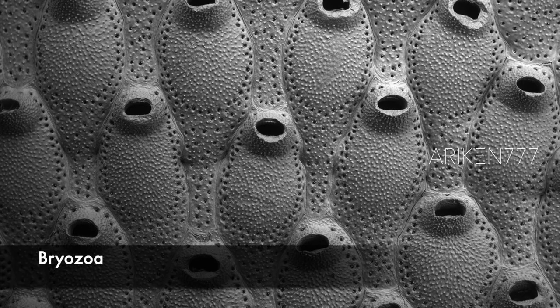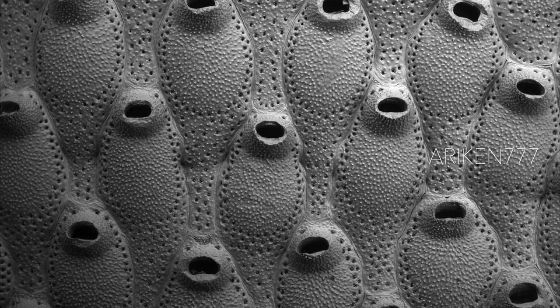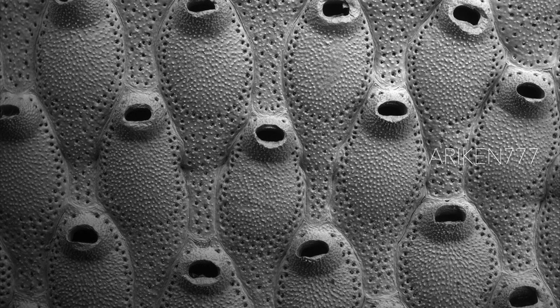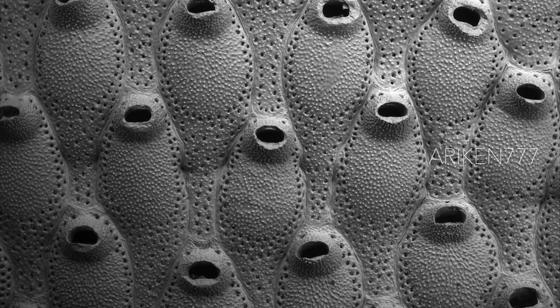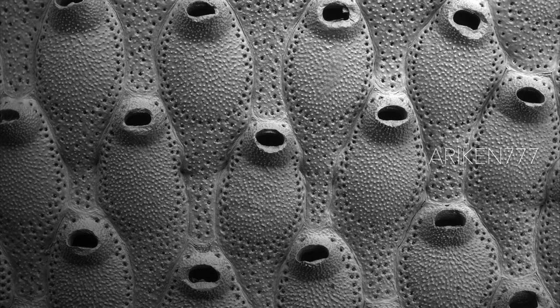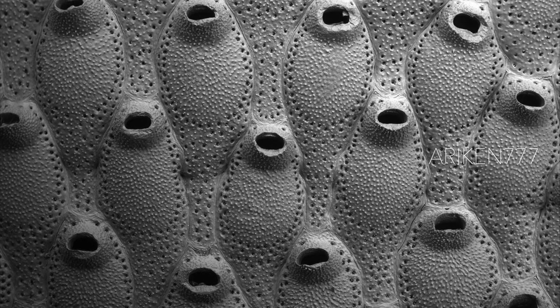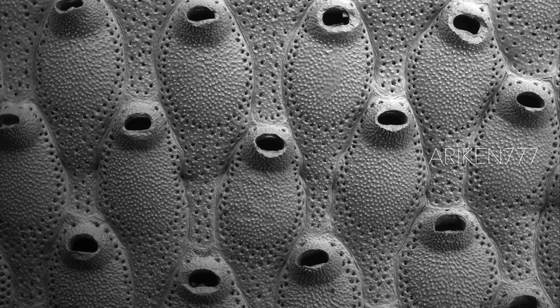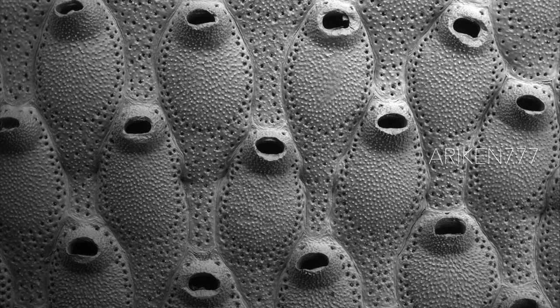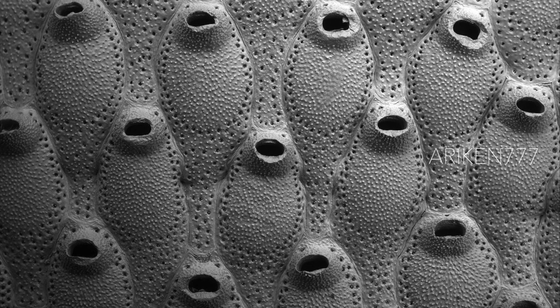These are the calcium carbonate skeletons of a bryozoan colony. Bryozoa are aquatic animals that consist of microscopic zooids that form colonies. A thin crust is formed around each zooid consisting of a protein and mucopolysaccharide material that can be calcified. Around 5,869 species have been discovered so far.